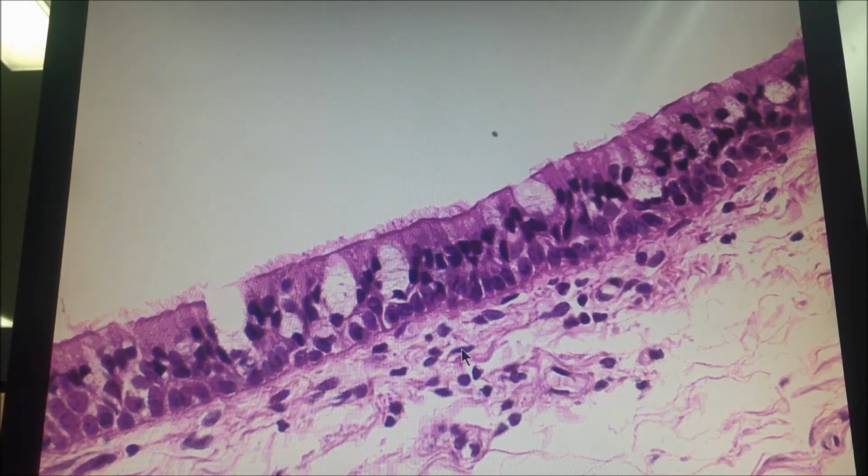شو الmost common cell in the connective tissue? The cell which synthesizes the collagen, fibroblast. If we pointed to any nuclei هون، بتحكي this is most probably a fibroblast. It is the most common cell in the connective tissue. شو second most common? Macrophage. So it's either a fibroblast or to a lesser degree it might be a macrophage, but mainly it is a fibroblast.